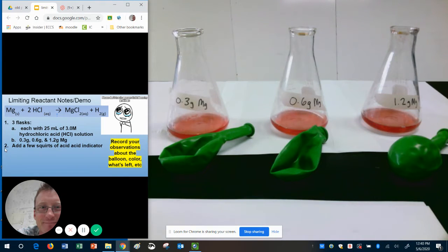As this reaction happens, the magnesium powder that we're going to add is going to react with the HCl. And when we're done, we don't have HCl on our product side. However, that's only true if we have enough Mg to react with all the HCl. So what we need to be looking at is what color will this liquid be if there is any acid left over, any of the HCl.